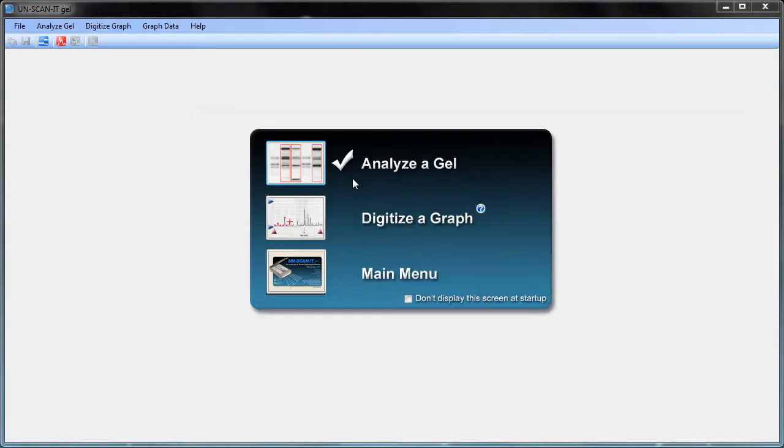A startup screen will appear when the software is open and a pop-up menu will allow you to analyze a gel. This option can also be selected from the main Analyze Gel menu or the Analyze toolbar.